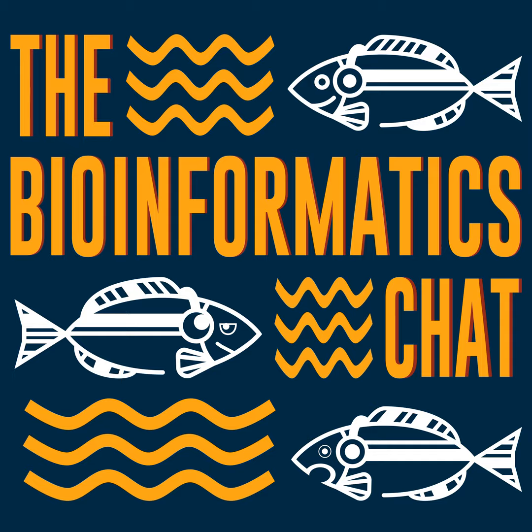We also don't need the enormous amounts of data that tend to be used to train base callers, since they need to observe a much larger sampling of variation and cover more bases, whereas we're just covering 96, so it's not quite as extensive of a problem. And because of that, our accuracy is a lot higher, and so identifying the molbits is not really the problem, but dealing with this read count variation that we just talked about is more of the source of the errors than the CNN. Are there any future directions where you might want to take this work?